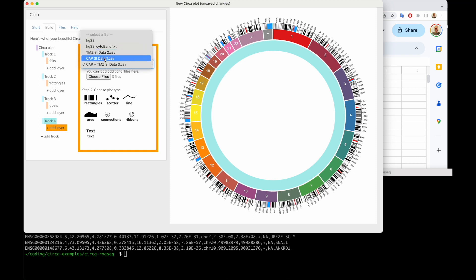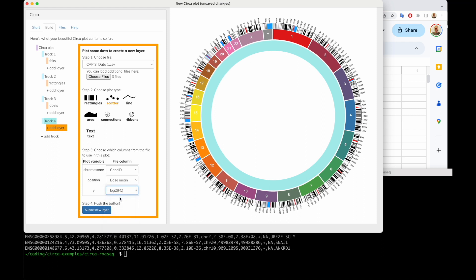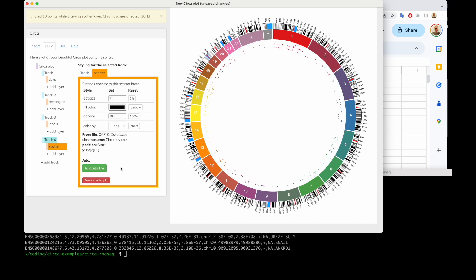I'm going to pick one of them. I'll choose a scatter plot first because I want to show the log2 fold change. For chromosome, I'm going to pick my chromosome. For position, I'm going to pick where each gene starts. And now we are ready to submit the layer.